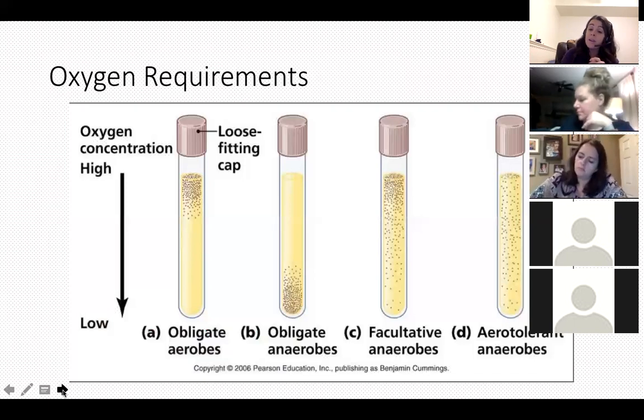And so if you have a bacterium and you're trying to figure out its oxygen requirements, you can perform this experiment where we have our tube, and within this tube is solid agar. And we get our bacteria on a wire. We usually call that an inoculating needle, and we stick it all the way down into this agar, and then we see where we have growth.